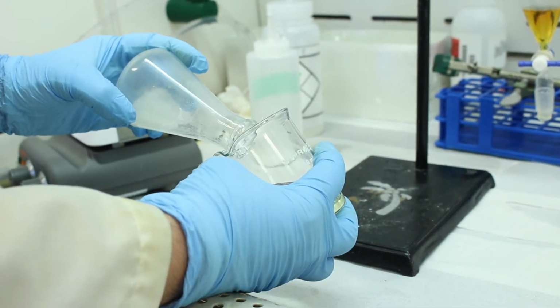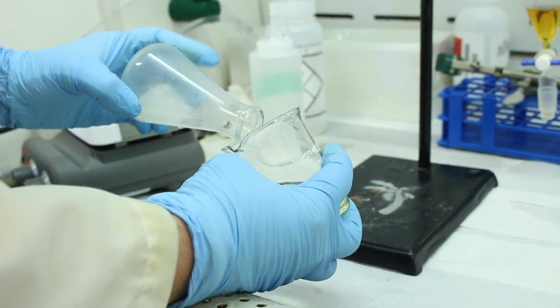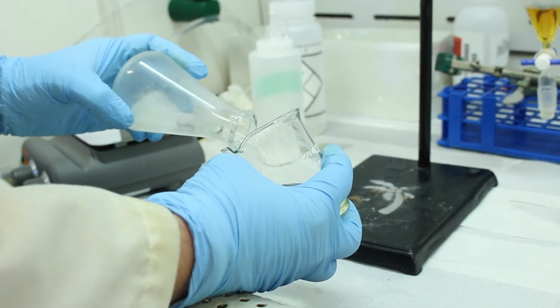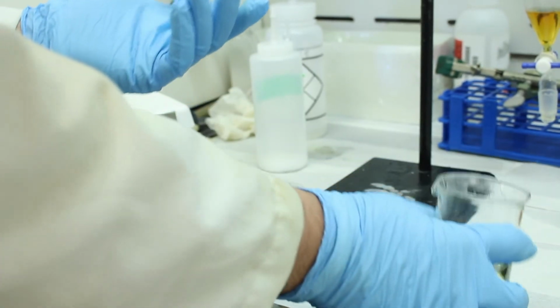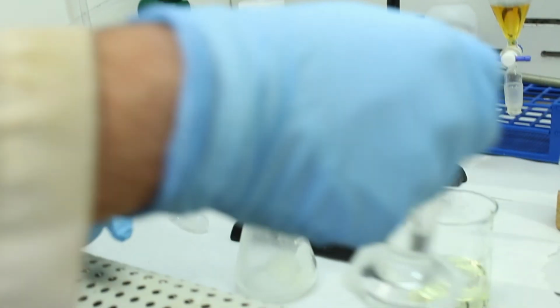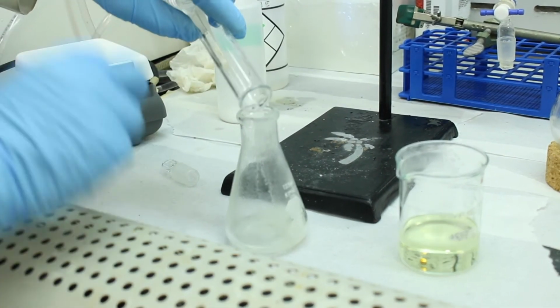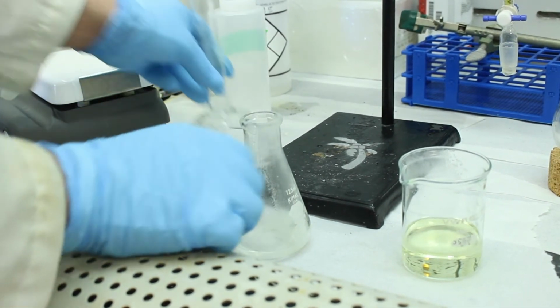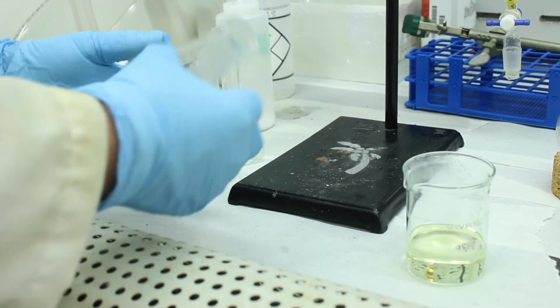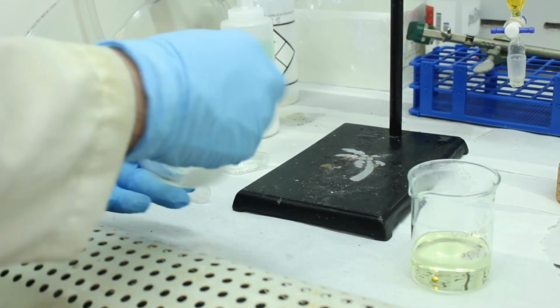The triphenylmethanol is pretty insoluble, even in organic solvents. So if you see the Erlenmeyer looks a little frosted, that's because the ether is evaporating and leaving behind a coating of the triphenylmethanol. So I have some ether here. We'll use it to rinse and try to transfer as much of the triphenylmethanol as possible. Yeah, see, already you can see that evaporating again.